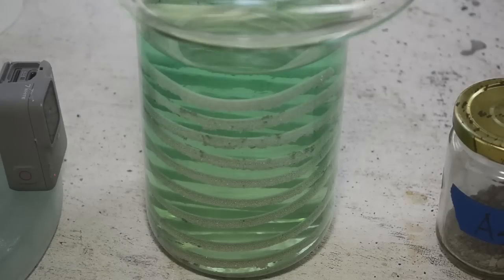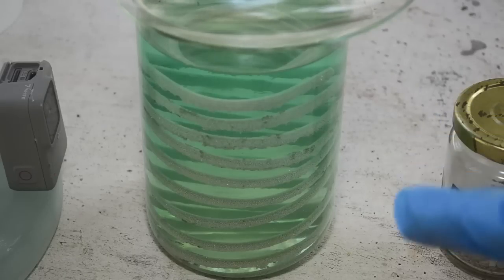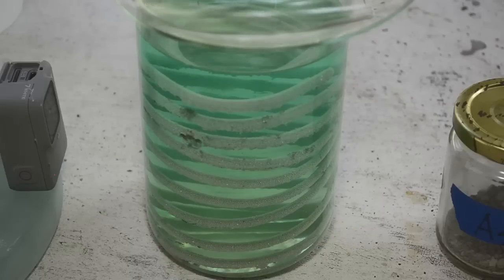Well, it's been less than 5 minutes, and I can already see bits of silver falling off of that coil to the bottom of the beaker. So it's working. The GoPro video should be interesting. So gonna let it go. And the liquid's getting more blue-green as copper is going into solution as the silver comes out of solution. So that's to be expected.